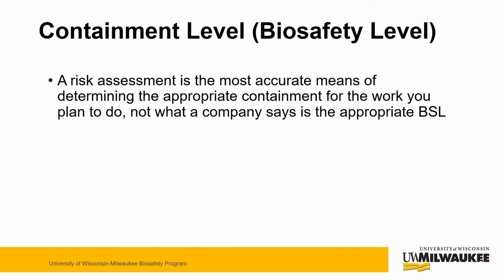Ultimately, determining the biosafety level necessary for the work that you're planning to do is done through an accurate risk assessment. You don't look at what a company says in a paper that they send when they send you a sample of the agent. You don't look at the risk group alone. It really looks at all of the different procedures and agents that you plan on working with, and then looking at the lab facility and the type of containment you're going to need to make sure that people and the environment are safe.